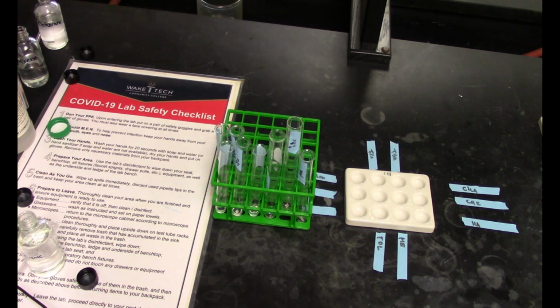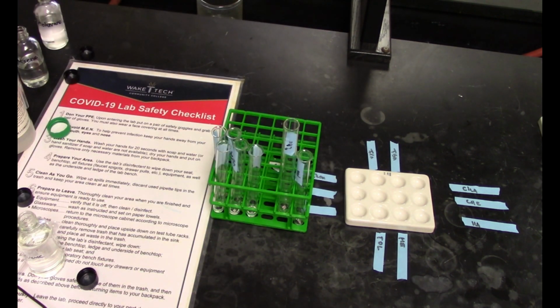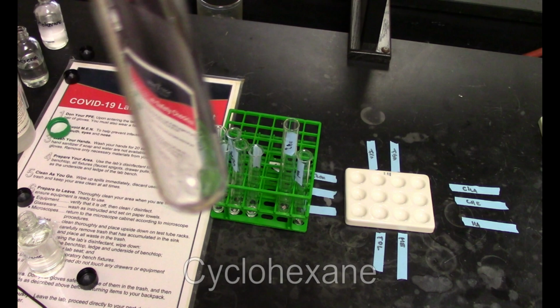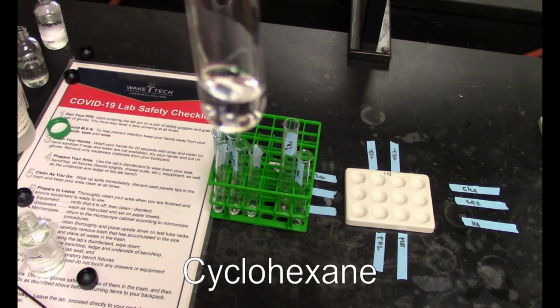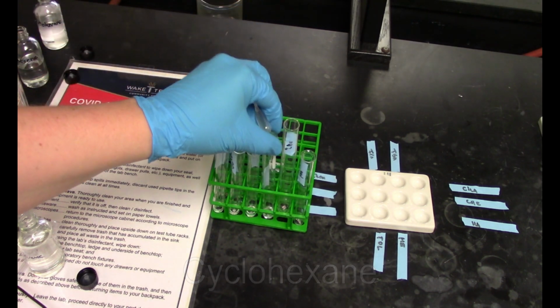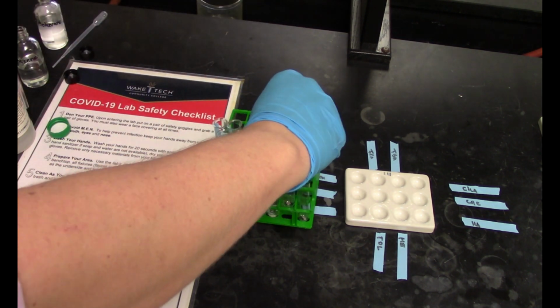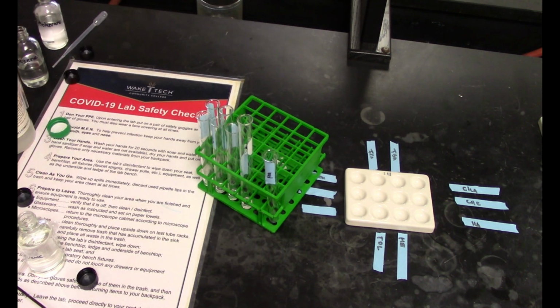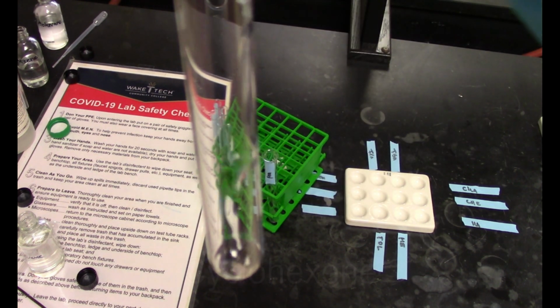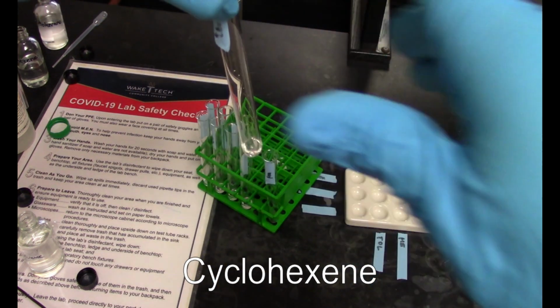So now let's move on to cyclohexane. So cyclohexane, it's just a standard run-of-the-mill alkane. We add our mixture to it, and what we don't see is any reaction with the sodium. So no bubbles are formed. Now we do cyclohexene. And we add the cyclohexene, no reaction.